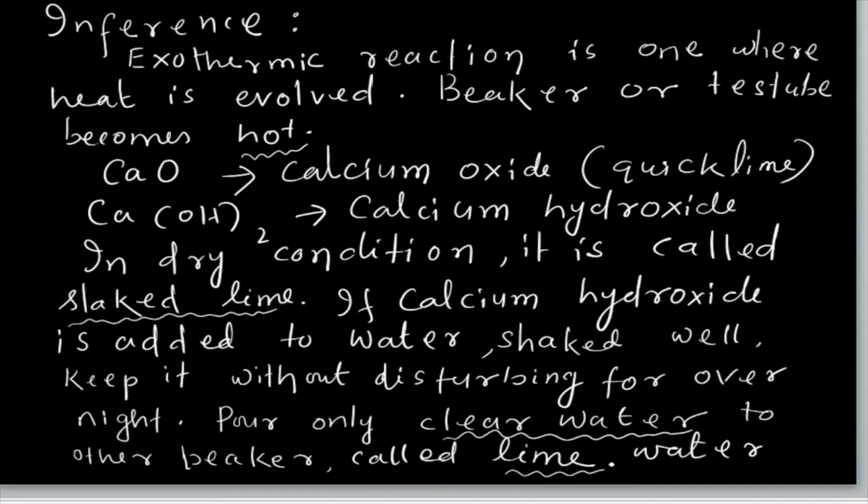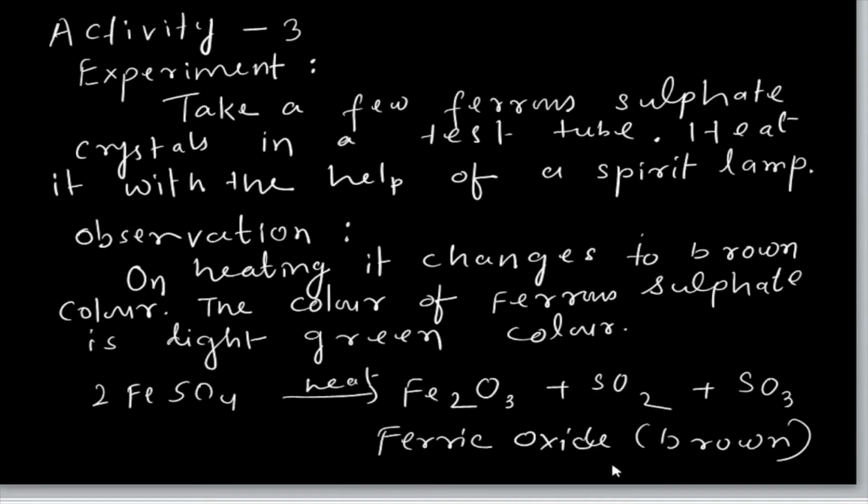Hope it is clear. And then what is lime water? When the solution is decanted, only the upper part, a pure clear liquid, is lime water.